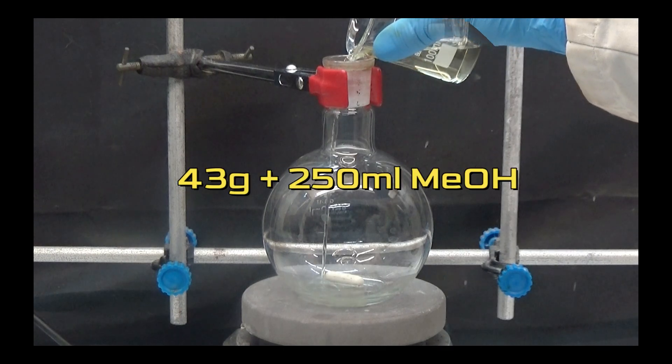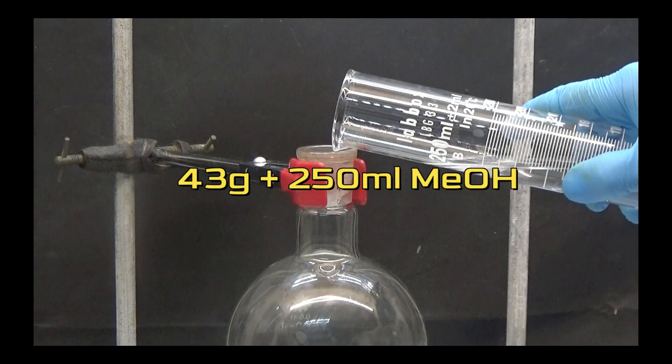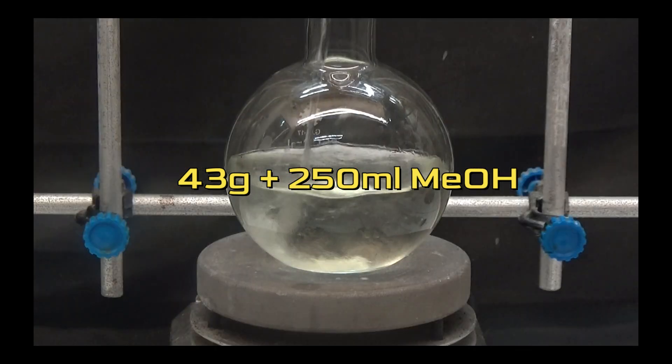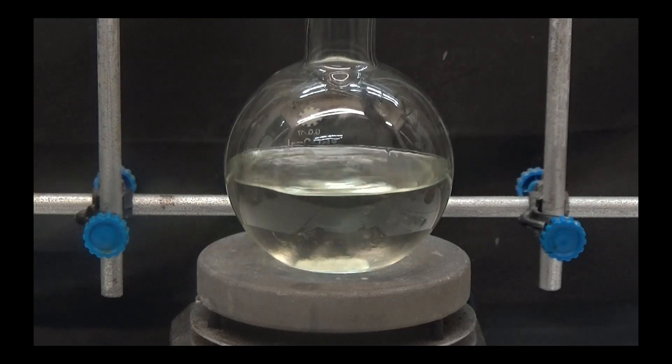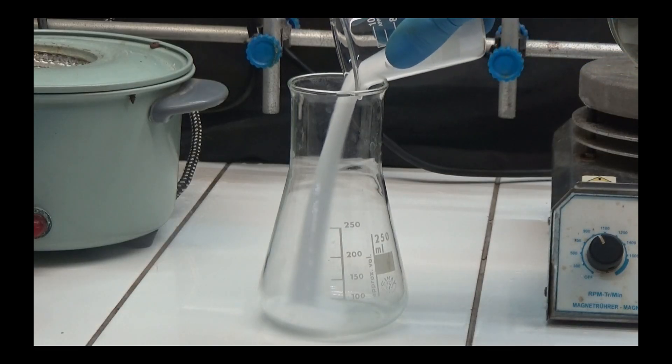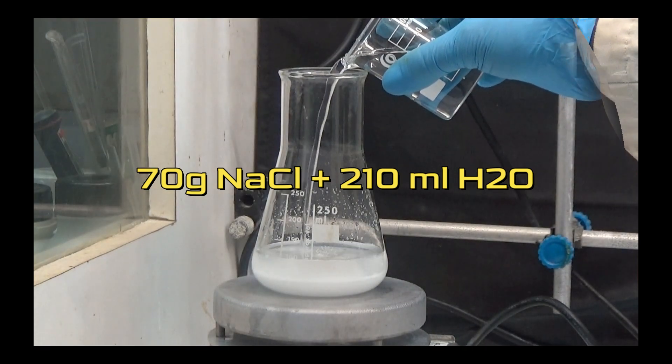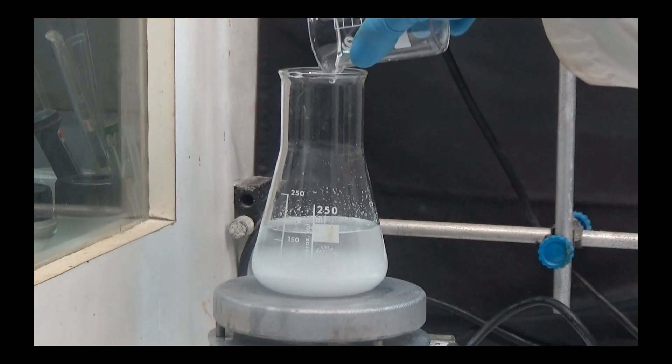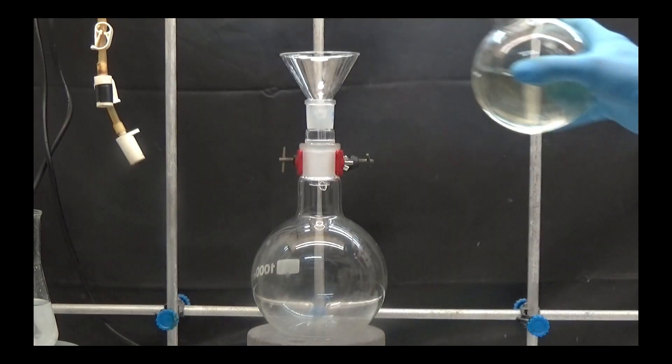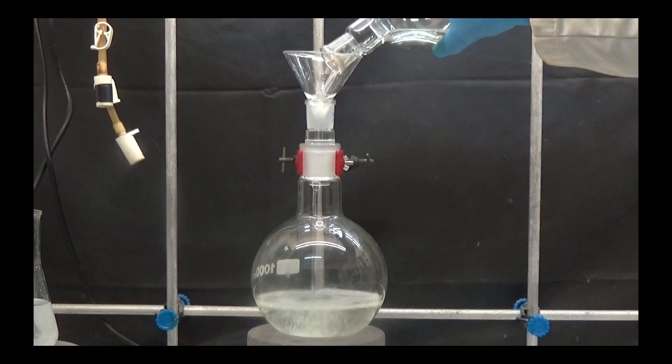In a 500 milliliters flask we added 43 grams of nitrobenzene and diluted it with 250 milliliters of methanol. In another flask we dilute 70 grams of sodium chloride with 210 milliliters of water. A 1000 milliliters flask is used to mix the two solutions.